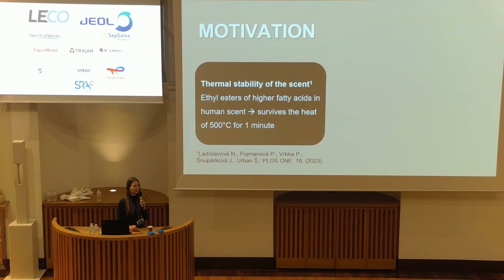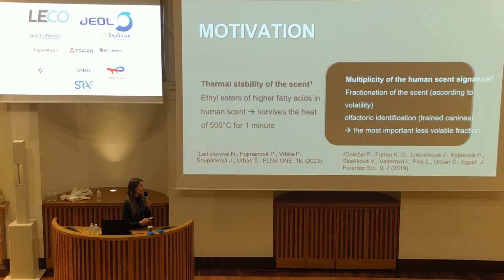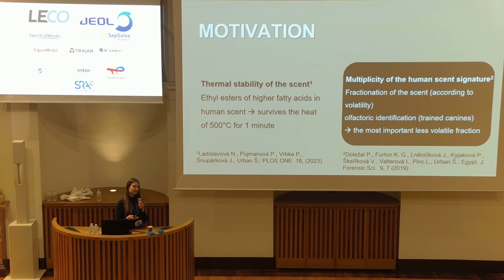So, beyond the obvious motivations to be able to implement those techniques in forensic practice, the previous studies that led to this experiment were on the thermostability of the scent. That means that there is a part of the scent that survives even the heat of 500 degrees Celsius for 1 minute, and it seems like it is the most significant part for individual identification. So, all together, it looks like this part of the scent could remain on the cartridge cases even after firing the gun.